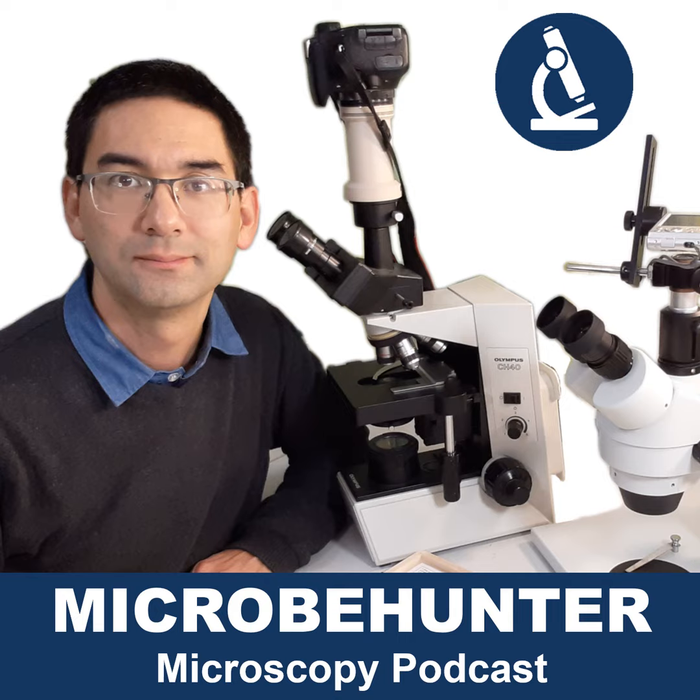The objective of this microscope generates a light beam which is not focused to a point, but where the light beams are parallel. And then only inside the microscope's tube, much later, there is an intermediate lens which bundles the light to generate the real intermediate image.